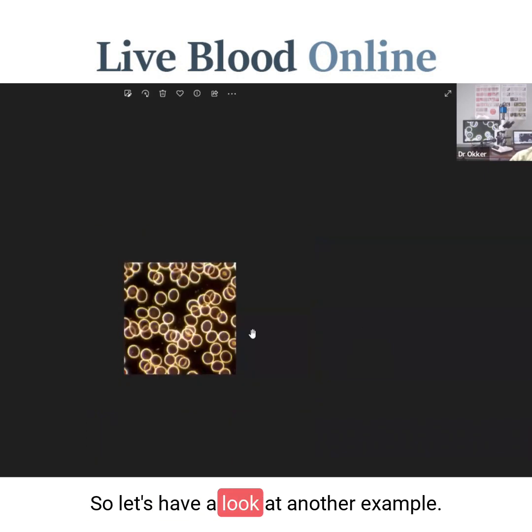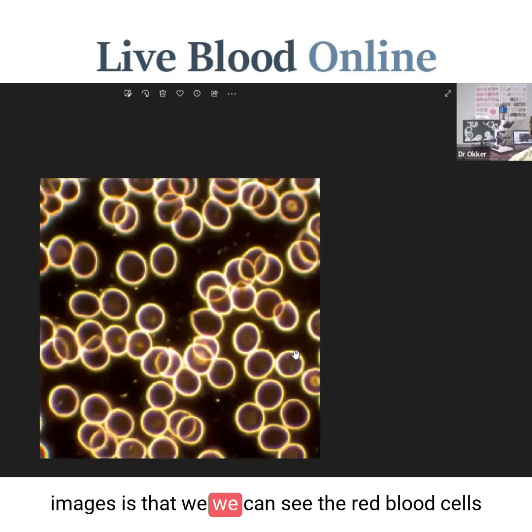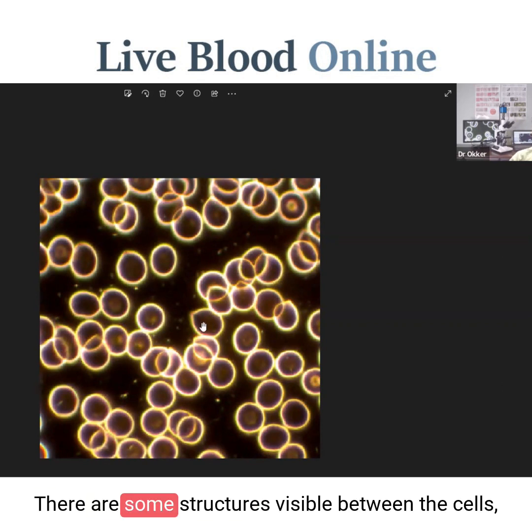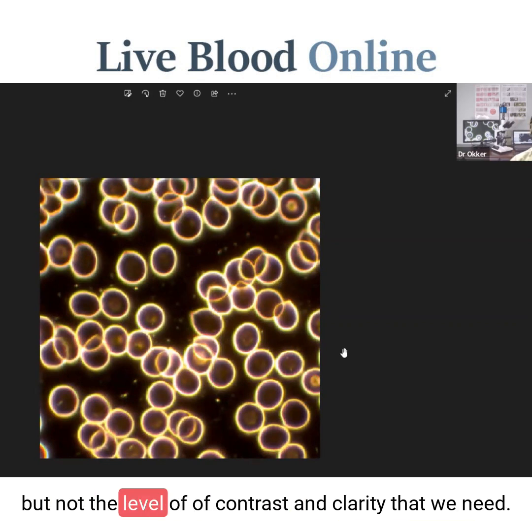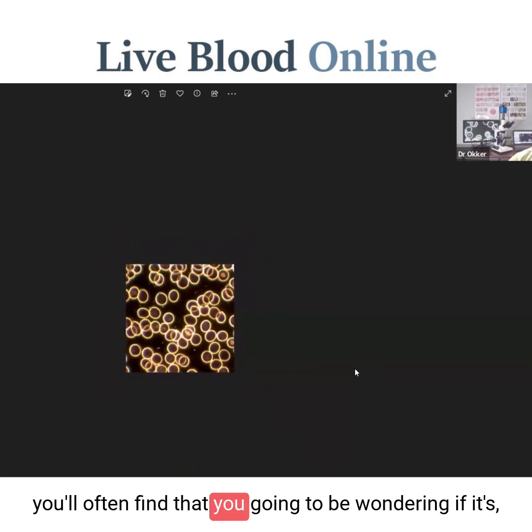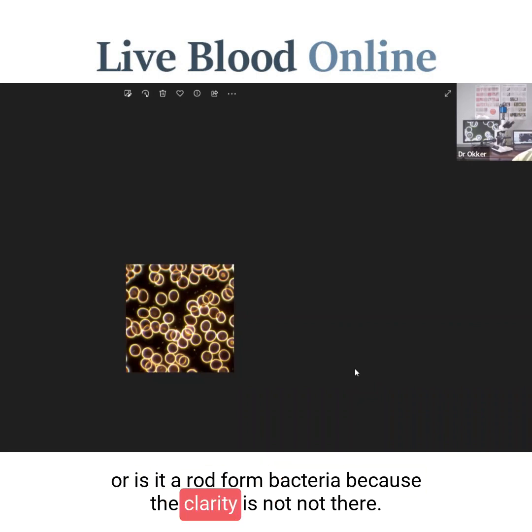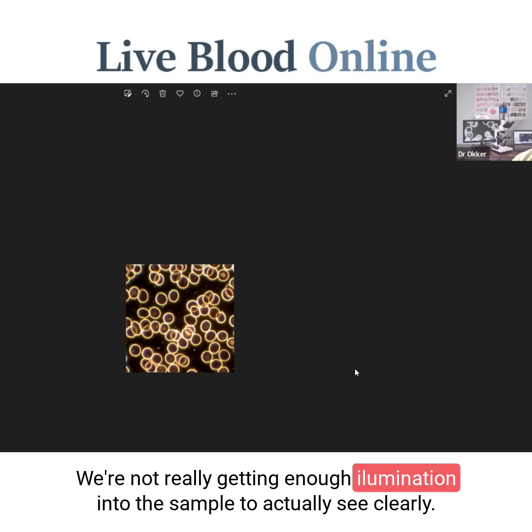With these types of dark field images you'll notice right away we can see the red blood cells but not really much else. There are some structures visible between the cells — some things in the plasma — but not the level of contrast and clarity that we need. When you work with a microscope like this, you'll often find yourself wondering: is it a chondrite, or an acid, or some uric acid, or is it a rod form bacteria? Because the clarity is just not there — we're not getting enough illumination into the sample to actually see clearly.